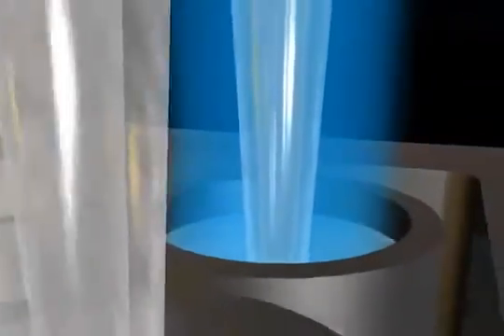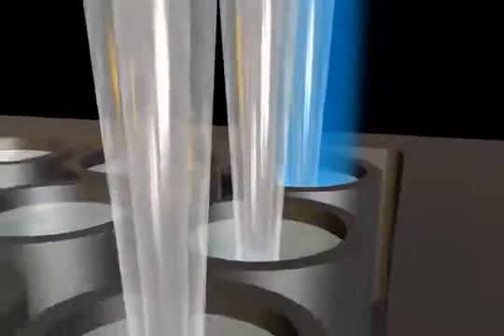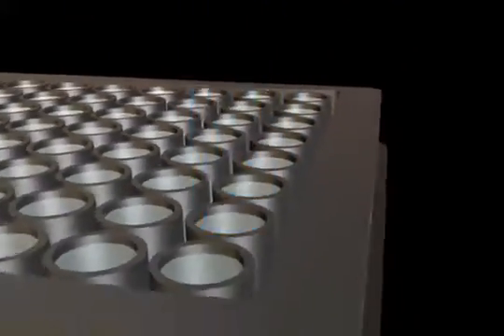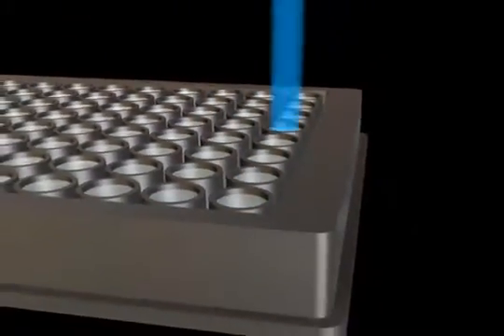Entire populations of cells are assayed at once, so you can explore more assay conditions in a single microplate. Integrated fluidics give you the freedom to explore agonist and antagonist assay formats.